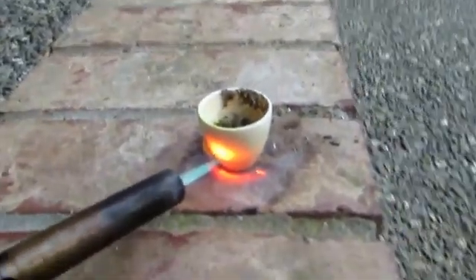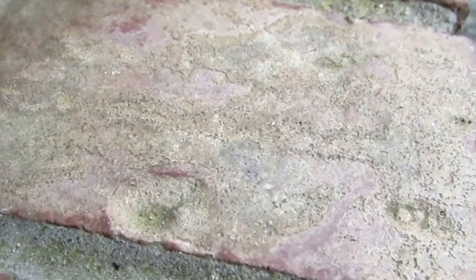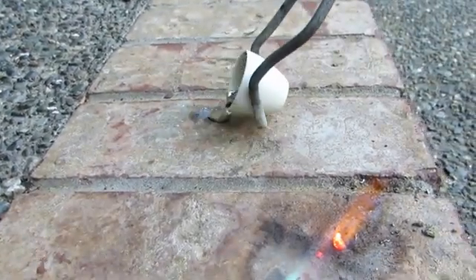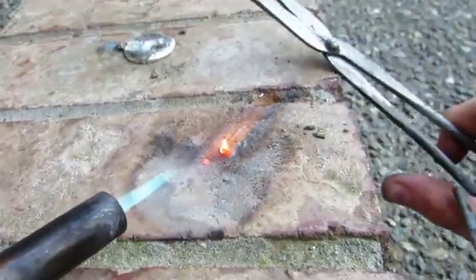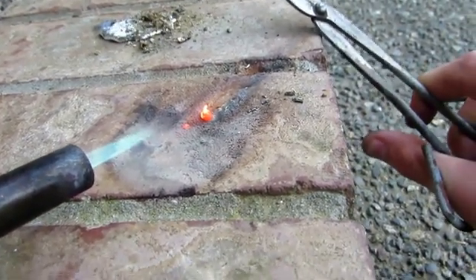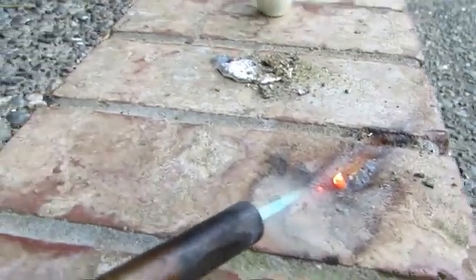Let's try to actually pour this out. We'll just take this crucible — there's our zinc. See if we can get this to pour right out. There is our zinc metal.